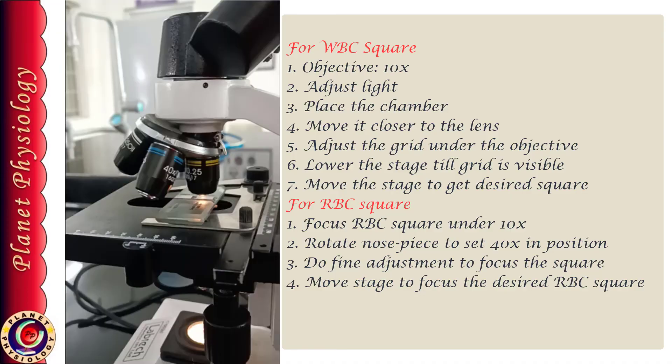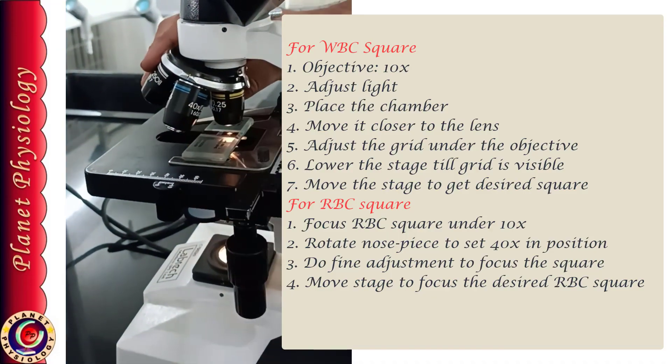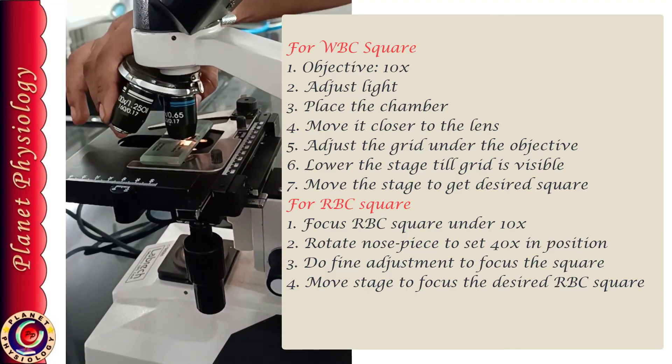For focusing the RBC square under high power, first focus the RBC square under 10x i.e. low power objective and then bring high power objective in position.